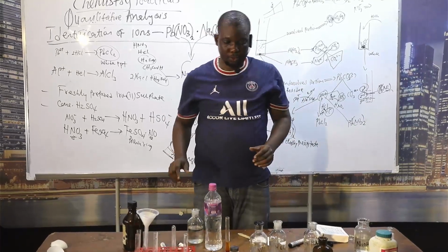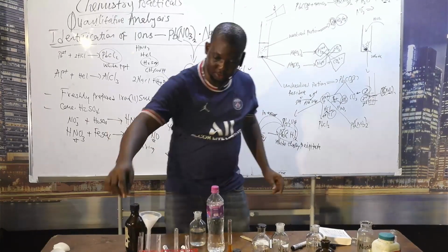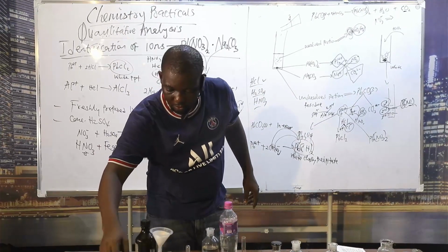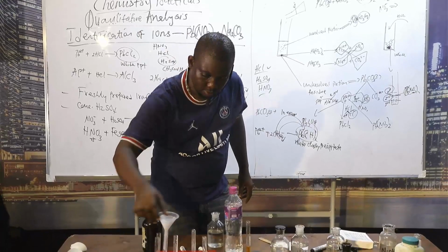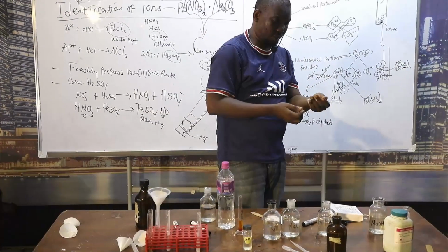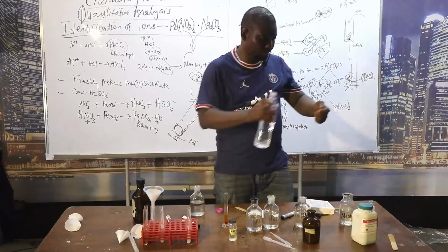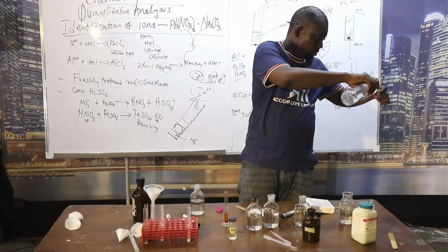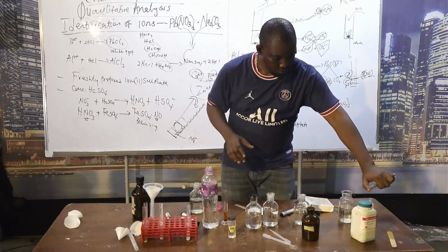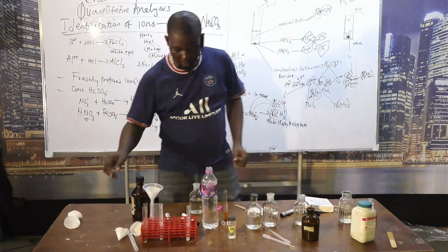So we look for our filtrate immediately. I mean, we have done the filtrate. The ring is still here. The filtrate is still draining. So use a clean test tube. Be very careful when you are carrying out qualitative work in the lab, because any traces of impurity will spoil your results.